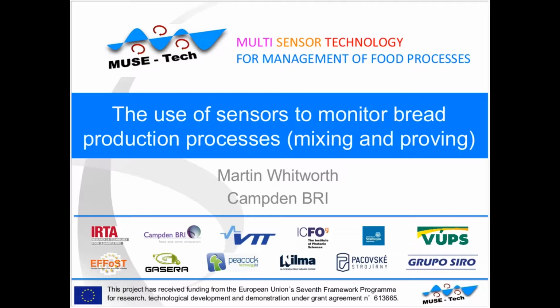This presentation is part of the MUSE-Tech project in which we're a partner. MUSE-Tech is funded under the EU Framework 7 programme, and it concerns the development of a prototype sensor for online measurement of food processes. And Campden BRI's involvement has been evaluation of the sensor for application to bread production, which is the subject of this presentation.